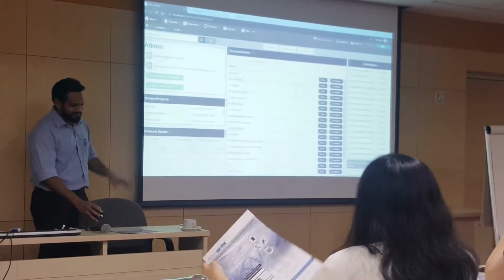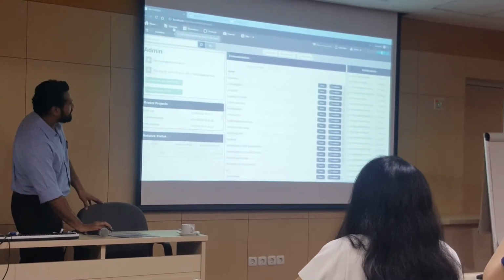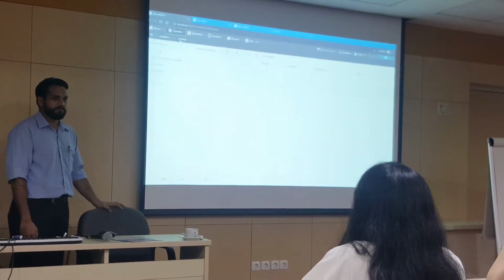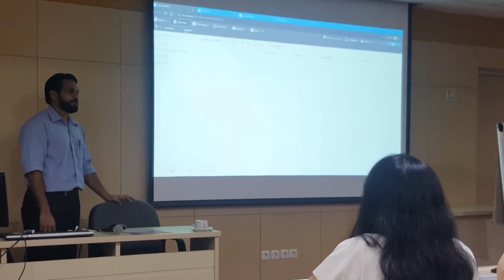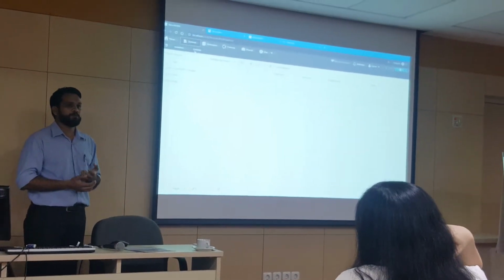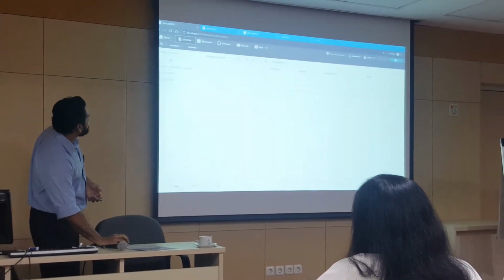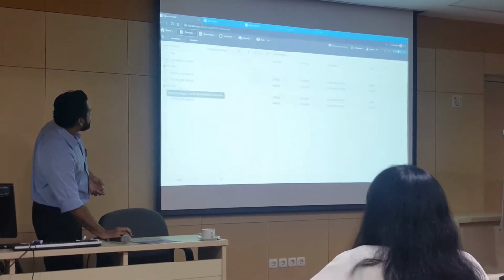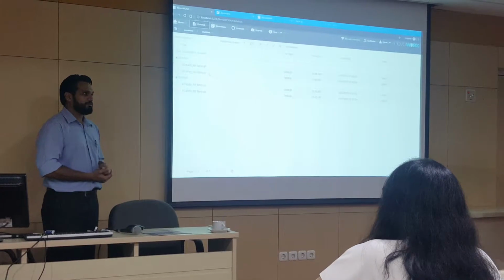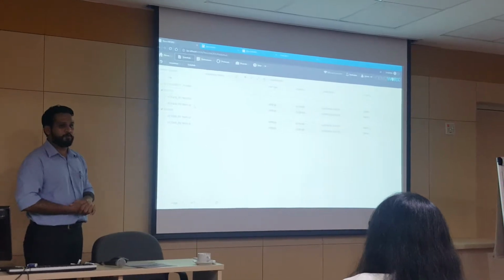I'm sorry for the resolution of this. So in novoWorx itself, we have a data hub, which is the data management system of novoWorx. So in the data hub, you can upload your reads and your input data. It will automatically arrange your reads into read groups based on the Illumina name convention. And if you expand, for example, your read group here, you can see that you have the read 1 and read 2 all combined under one read group itself. So if you have multiple lanes, multiple reads for the same read group, it will all be put into this multiple read flow.